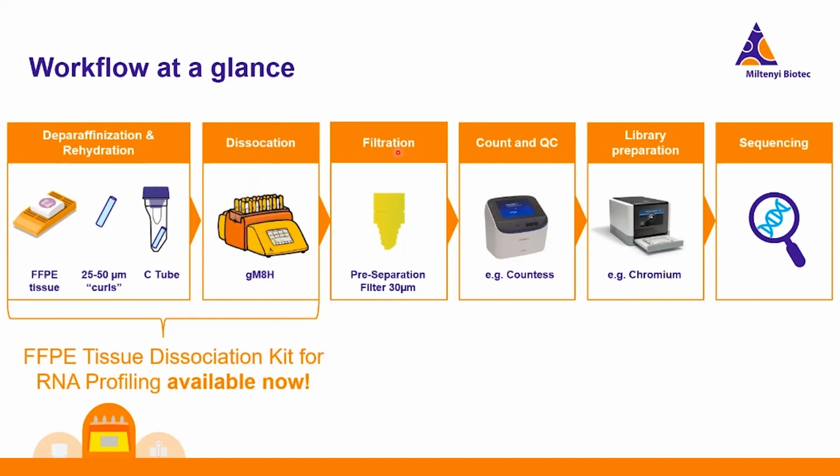Afterwards, you perform a filtration, you count and QC your sample before then going for the NGS workflow.